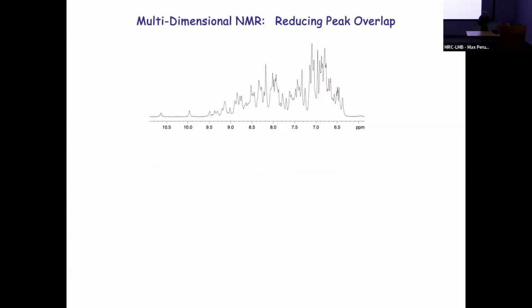spectrum. If we look at that for a 10 kilodalton protein, this is very typical, a nice small folded domain. So it's something a little bit larger than the size of ubiquitin, for example. So it's around about the size you'd get for individual domains in proteins. And this is just part of the NMR spectrum. It's showing the region of the amide hydrogens in the backbone of a protein. And you can see the immediate problem is there are so many signals in there, and the amount of overlap that occurs makes it difficult for us to extract anything really of genuine interest from a spectrum like that.